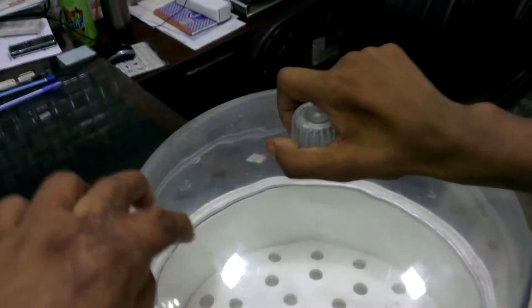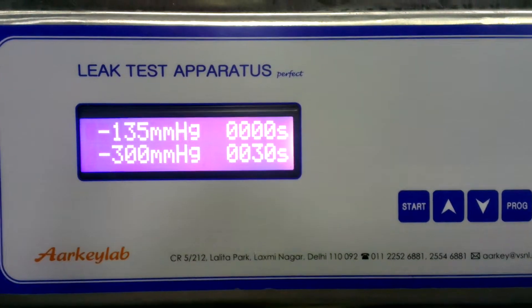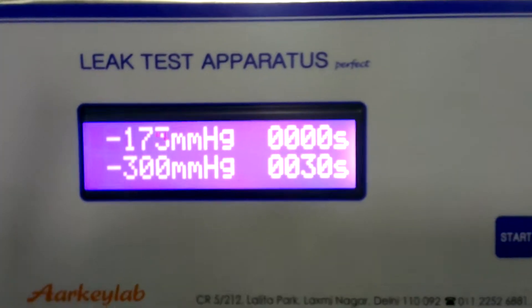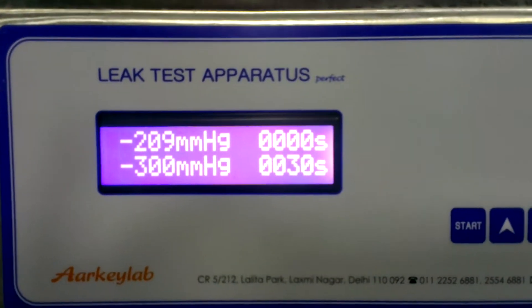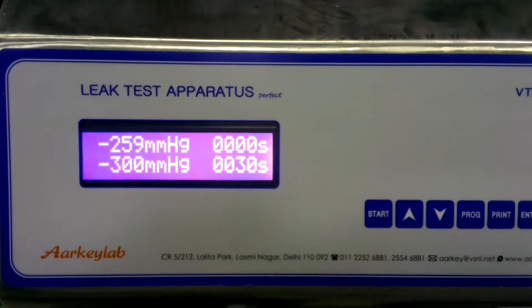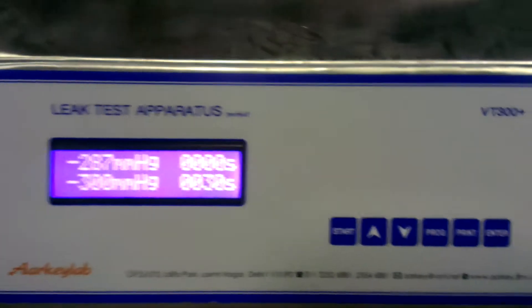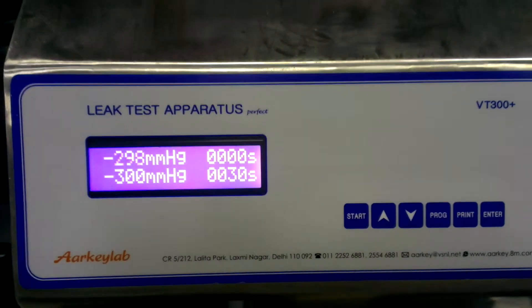Press the lid gently. You can see it is holding. Vacuum is increasing. After it reaches 300, the system will stop. The pump is now off and it is maintaining 300.